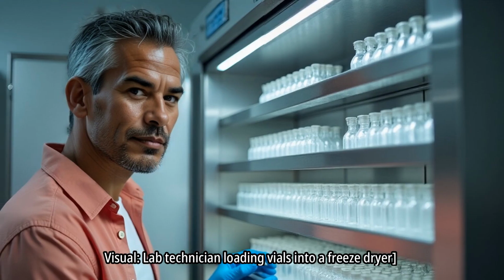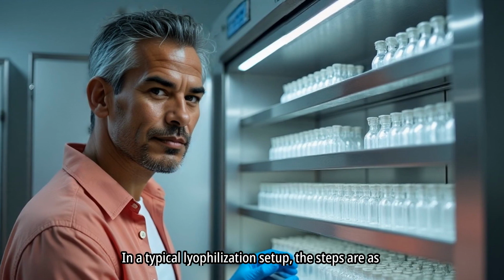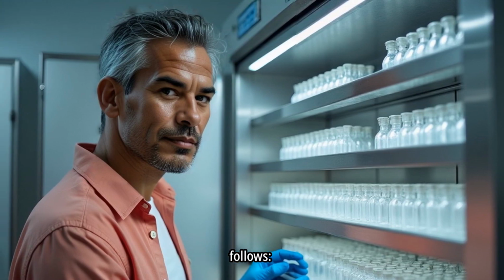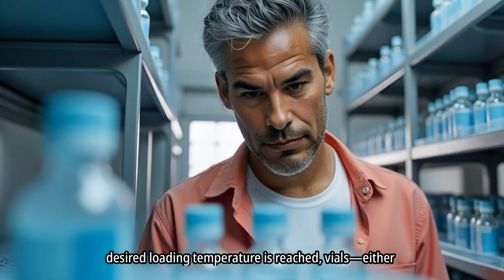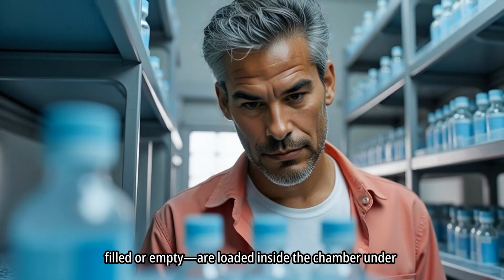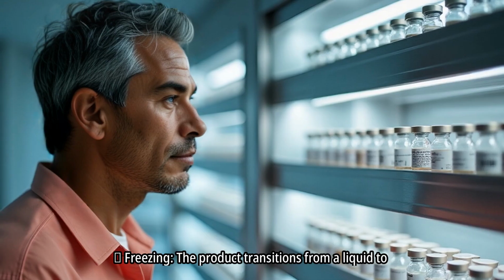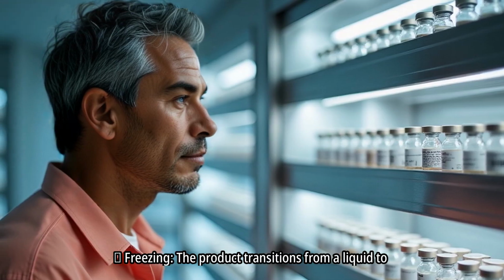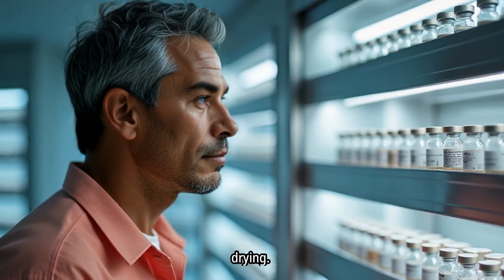In a typical lyophilization setup, the steps are as follows. Loading. The freeze dryer is started, and once the desired loading temperature is reached, vials, either filled or empty, are loaded inside the chamber under sterile conditions. Freezing. The product transitions from a liquid to a solid. Proper freezing ensures a good structure during drying.